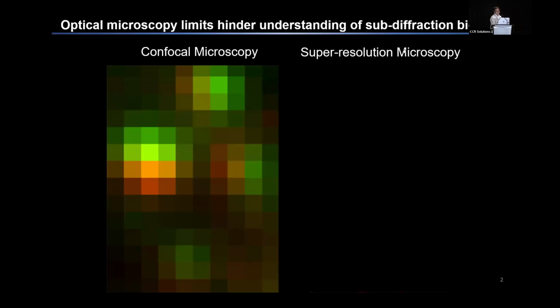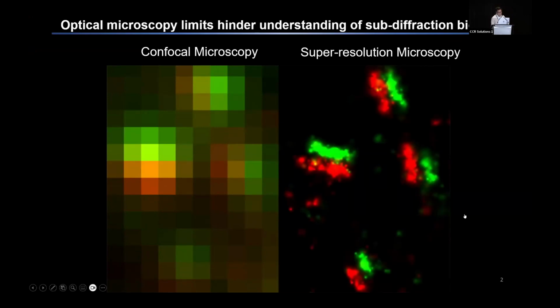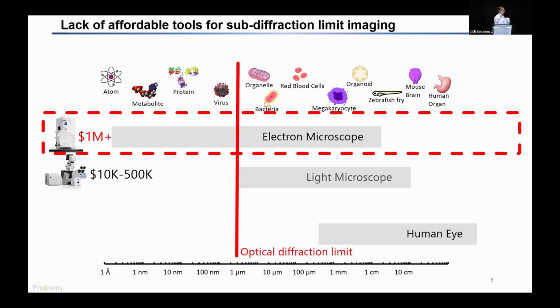Okay, great. I didn't know that Natalie already gave a crash course on expansion microscopy, so I'm going to go through this very fast. We all know that confocal microscopy is diffraction limited, and then we have super resolution, but we all know super resolution systems often require very expensive equipment, complex sample preparation, and are sometimes a little slow. So I think the take-home message is that in order to extract nanoscale information from a complex biological system, it comes at a cost.